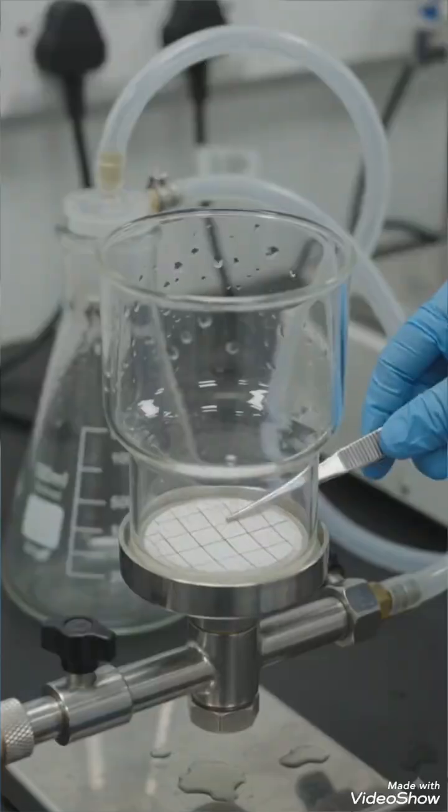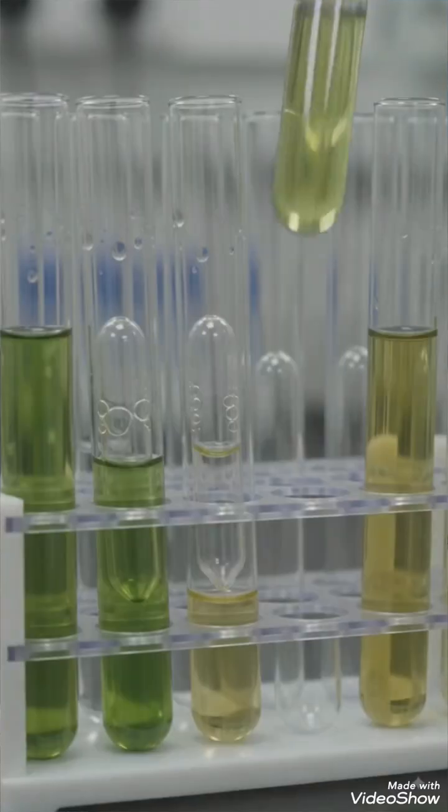Microbial enumeration assesses quality and safety. Standard plate count gives colony counts, membrane filtration counts colonies from filtered samples, and most probable number offers statistical estimates.